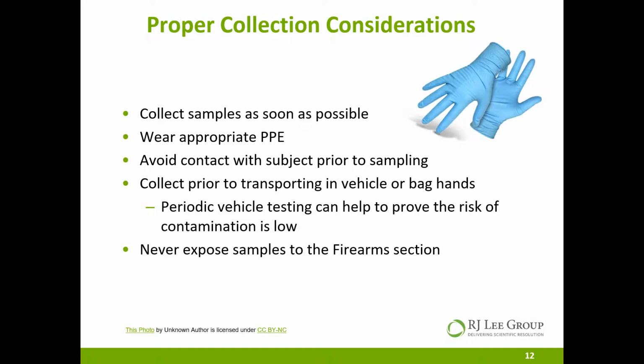If you have recently fired your gun, you should not be the person collecting samples. There should be somebody else that should come to collect them. Any possibility you can, and anything you can do to eliminate any potential risk of contamination, we want you to try to do. Prior to collecting samples, you also want to avoid contact with the subject as well, so specifically the subject's hands. If possible, collect samples prior to transporting the subject in your vehicle.